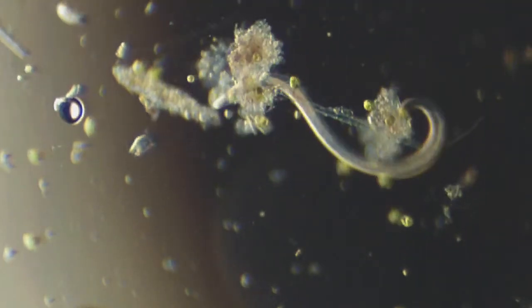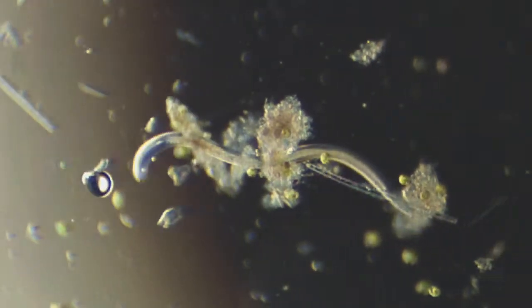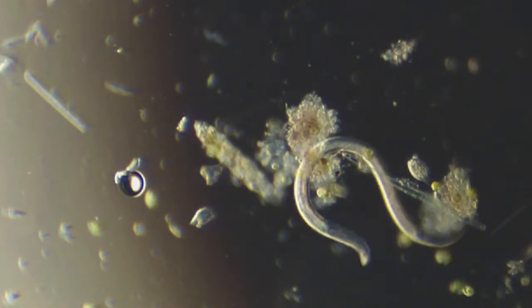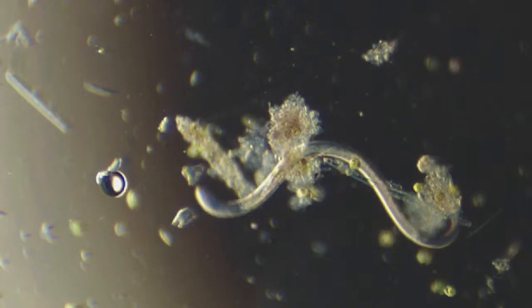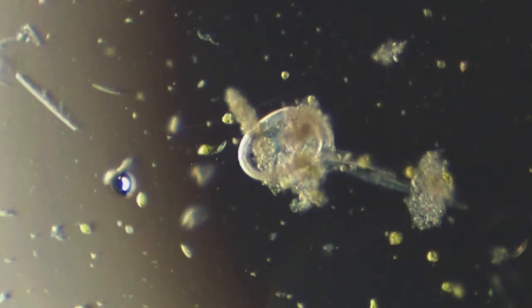More entangled. Nematode is having fun. See how it slithers through material so easily? This is a perfect little example of that. Oh, and it just knocked a Euplotes loose.